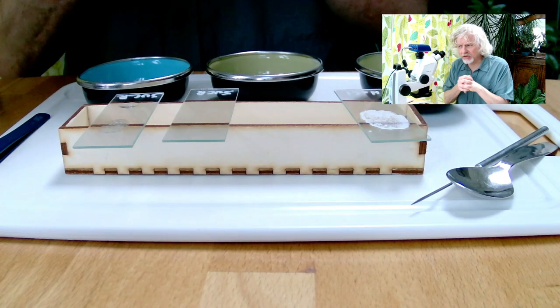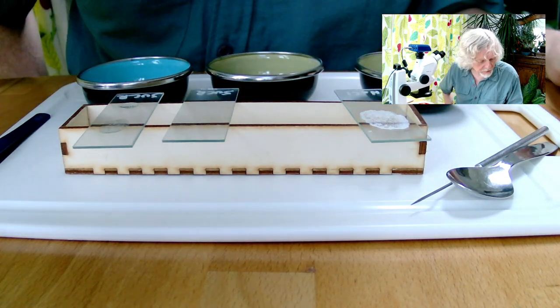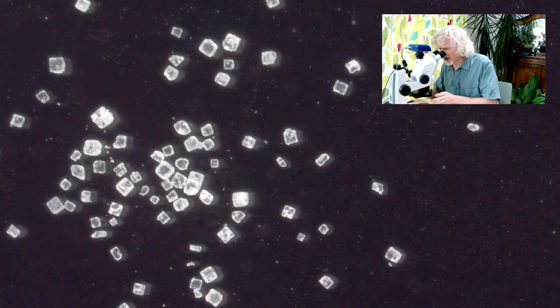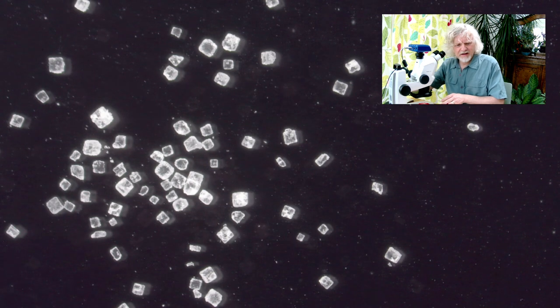But all you need to know is that it's really good for crystals because it shows up how twisted the light gets when it passes through the crystal. So here we go. This is what salt looks like under the microscope. Now, if I just focus that ever so slightly, there you go.